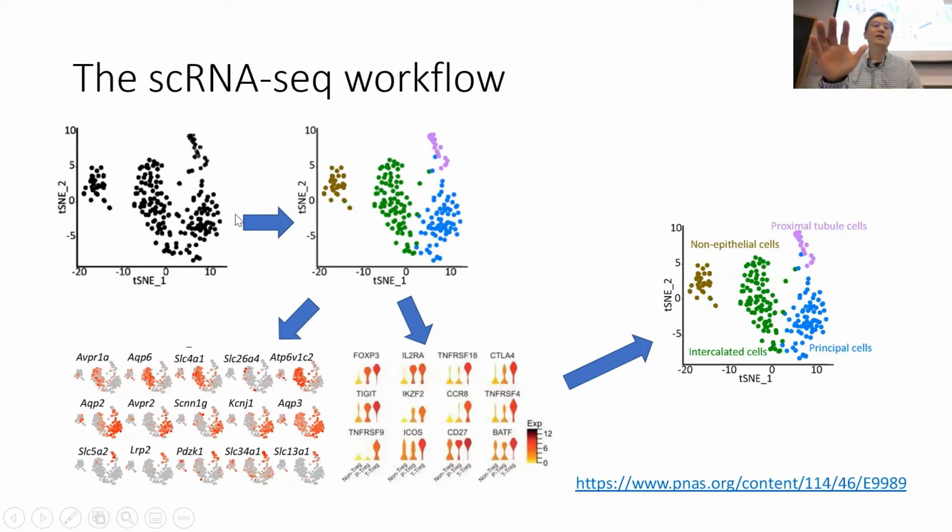So we are following this single cell sequence analysis flowchart, and step by step this week we move to clustering. The purpose is that after you cluster, you learn the features as a group of cells rather than unstructured data. So you can see the average expression of certain genes for each group. If you see a difference, you know, okay, those are the marker genes for certain clusters. So that's our purpose here.